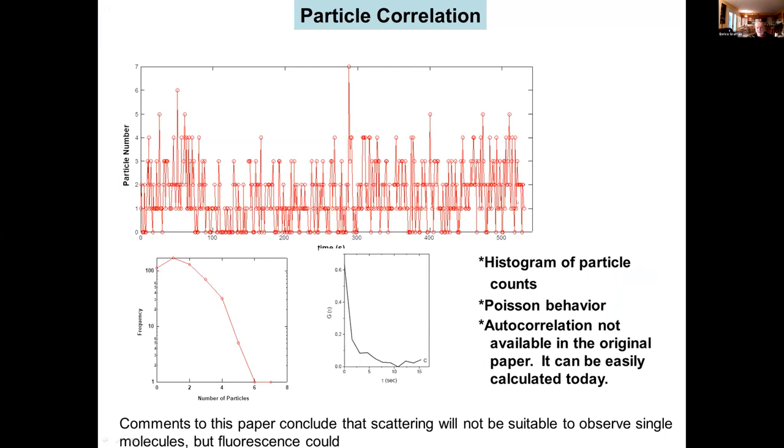And then if you observe this sequence, you will observe something which is strange, because everyone in the audience can see that it is very difficult. So you have for a long time no 0 particles or something, and maybe you can interpolate with your eyes and see that actually the number of particles fluctuates with some frequencies. And this is what gives rise to the behavior of FCS.